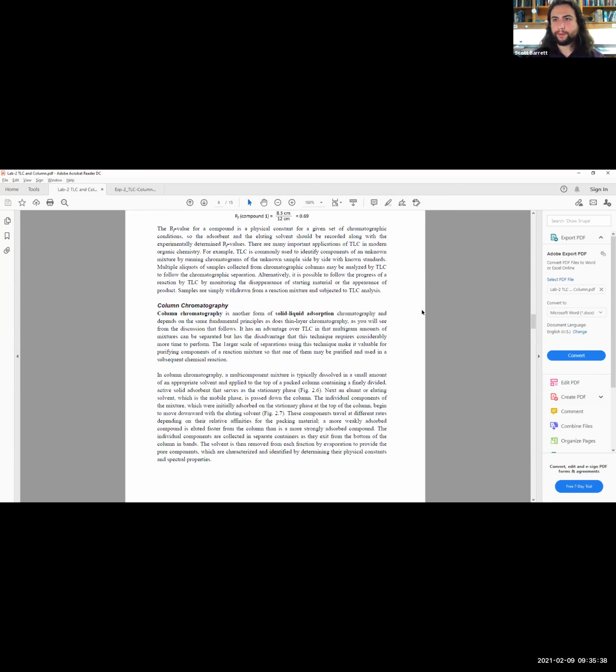Yeah, so, okay. Do you remember the phrase like dissolves like? Yeah. Okay, so that is where we're going to start the basis of the conversation. Think of this silica plate as polar, right? So if you have a polar compound, then it will want to stick to your silica plate more because like dissolves like, they're both polar. Your solvent that you run, the mobile phase, is non-polar. So if it's more polar, then it will want to stick to the silica plate more.